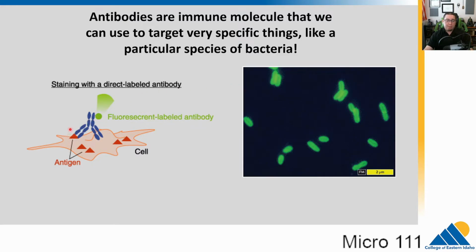We apply it, it sticks to it, and then we wash the slide, washing off any unbound antibody. And then we've attached to it this glowing little green molecule. And when we excite it with the proper wavelength of light, it glows green. And this is really great because we don't have any background stuff. We only see this green light. So we only see positive signal. There's no dust or background images, things like that.